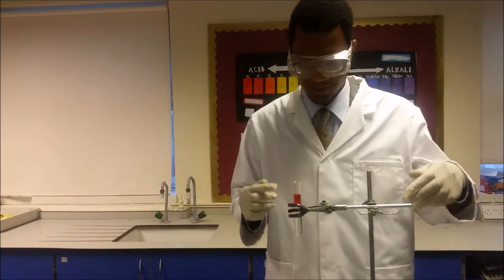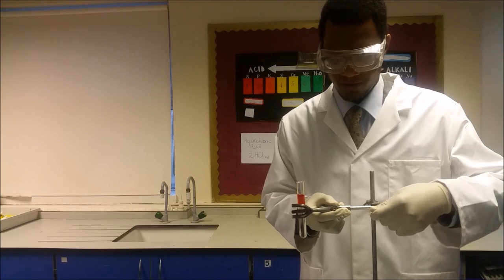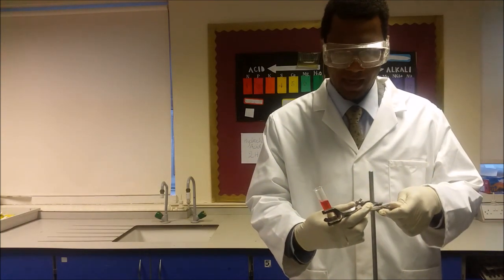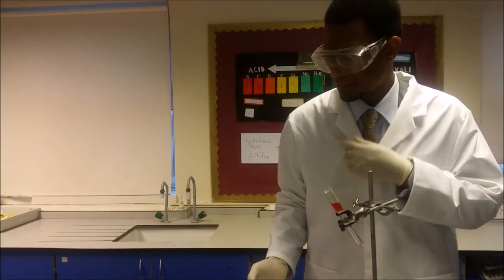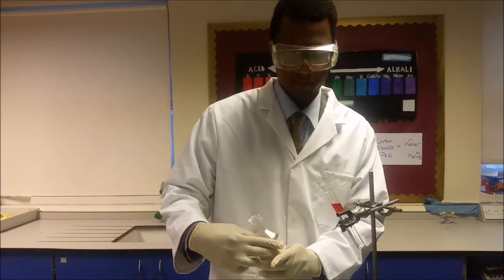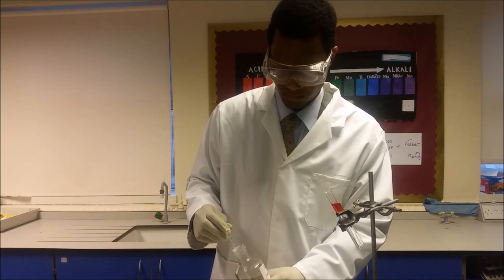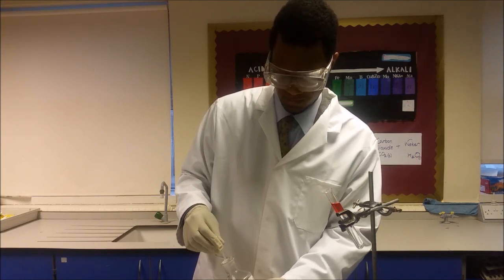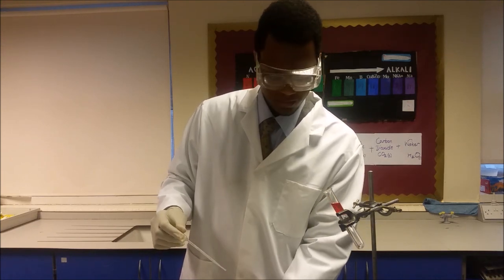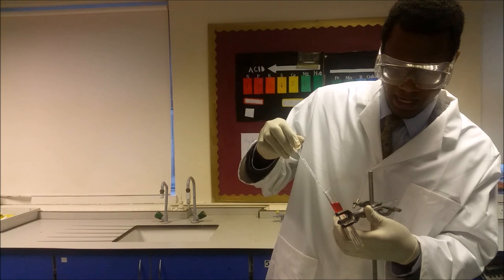For the next part you'll need to tilt the test tube slightly — it's very important that you do that. Tilt the test tube and then you're going to add approximately three milliliters of the sodium carbonate using a pipette. It's important when you do this that you do it very gently and down the side.